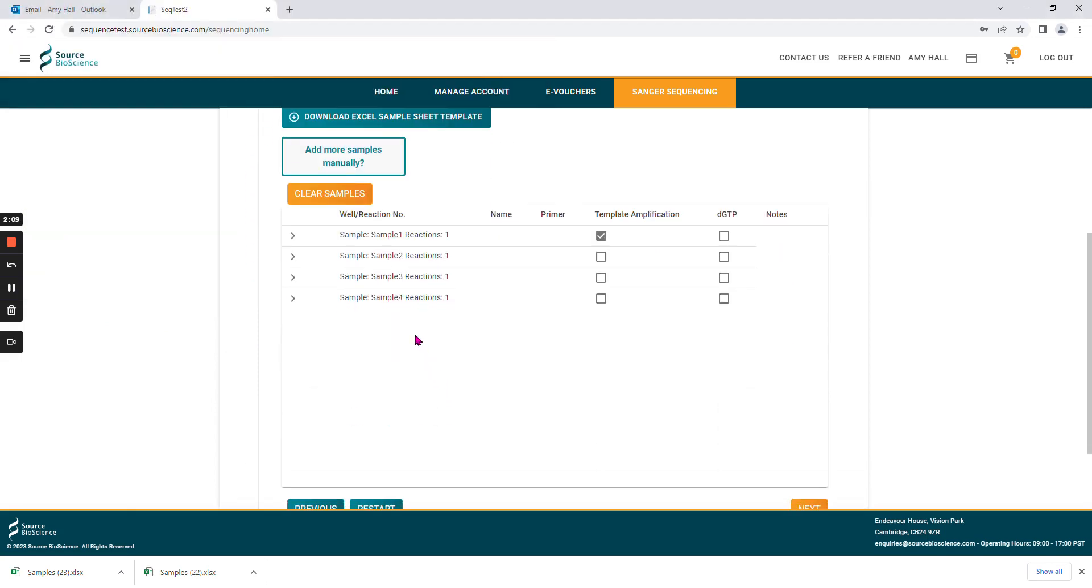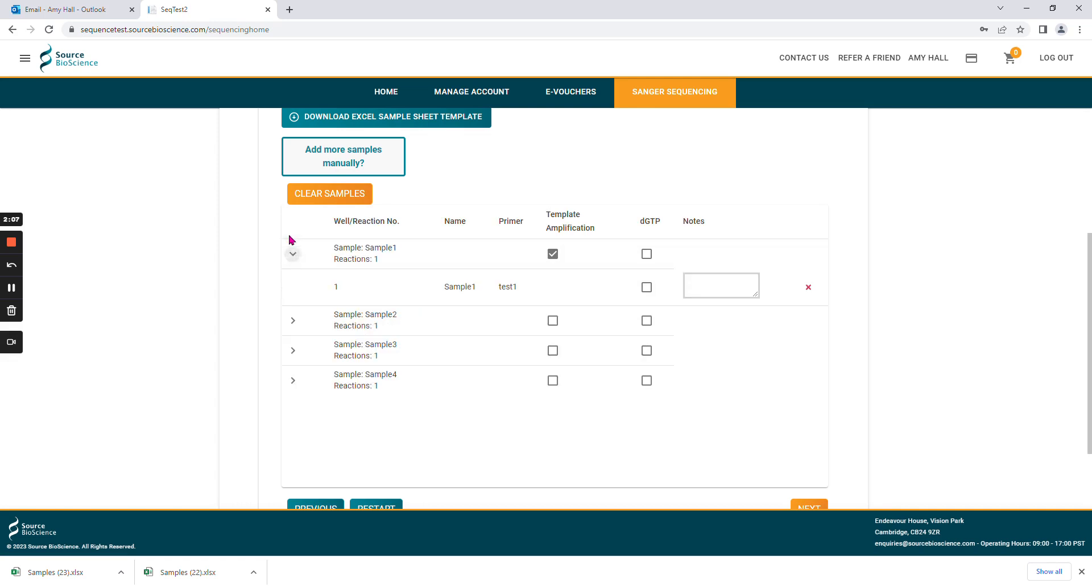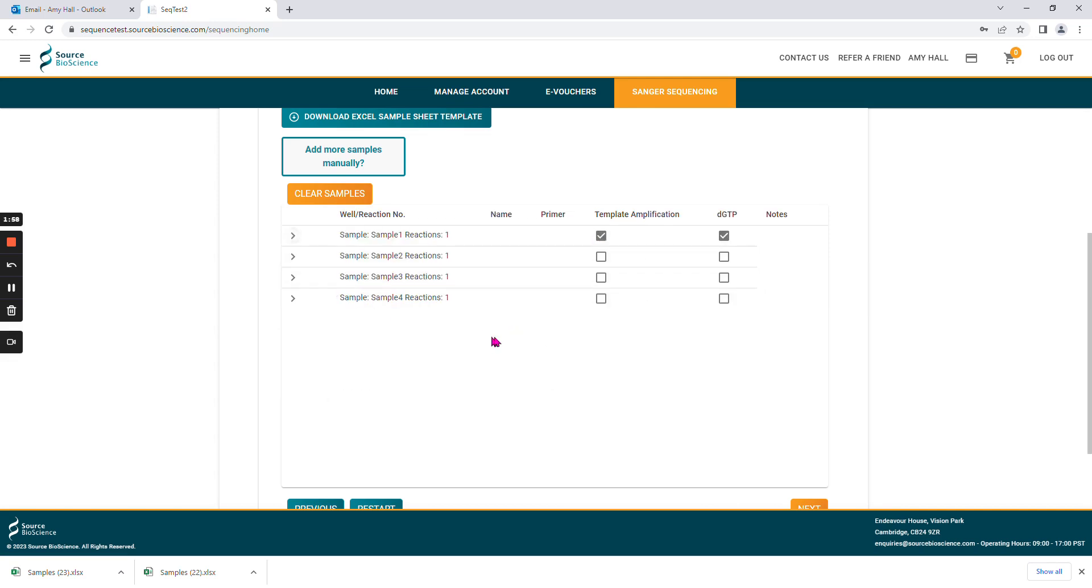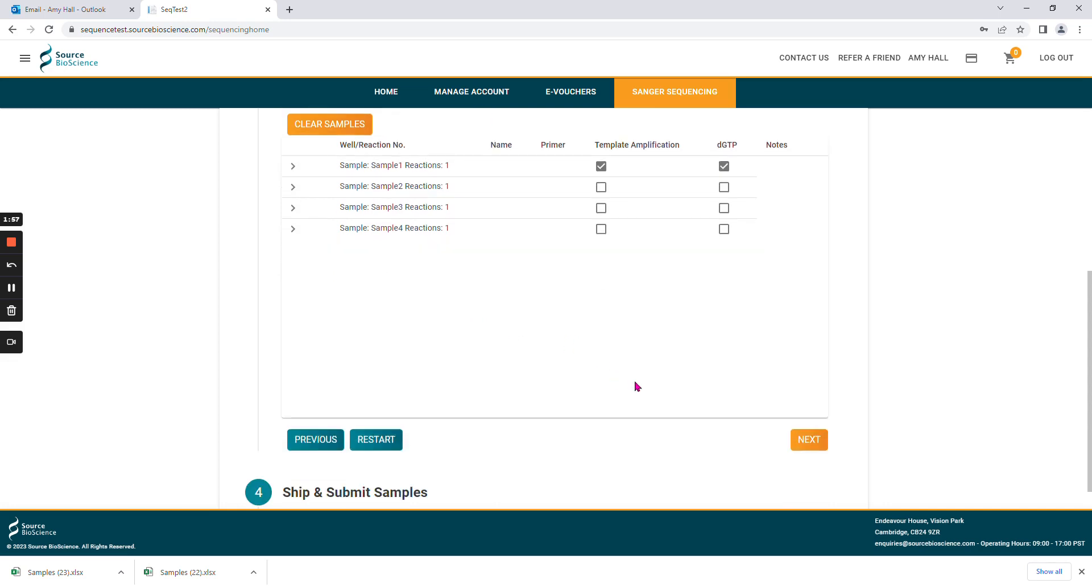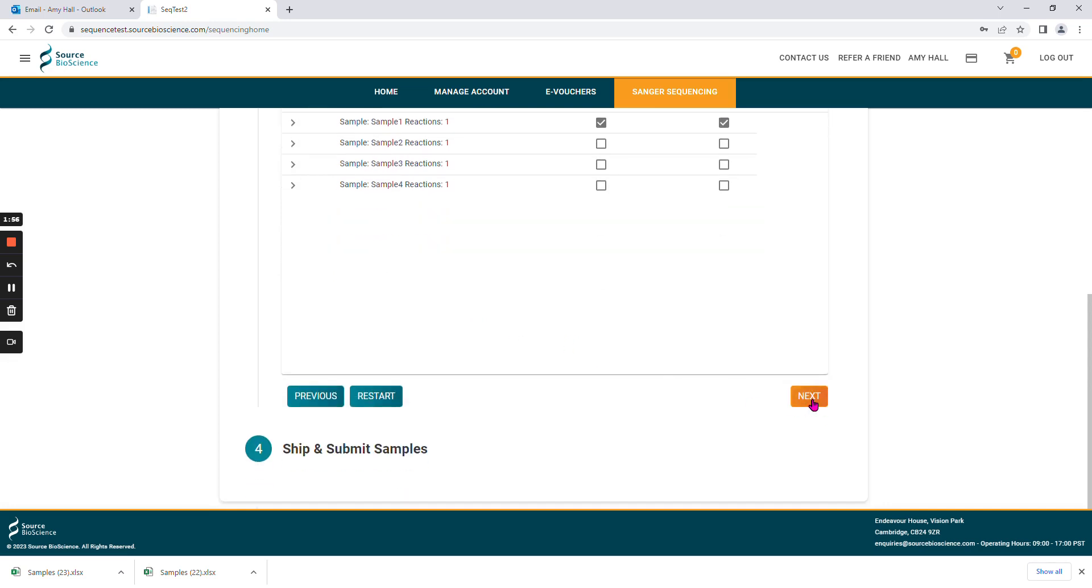This will give you a table that summarizes the reactions that you've added. Here you can add notes to the individual samples, or you can select and unselect pre-treatments. Once you've completed your order, please select next.